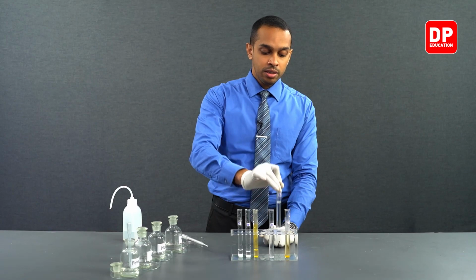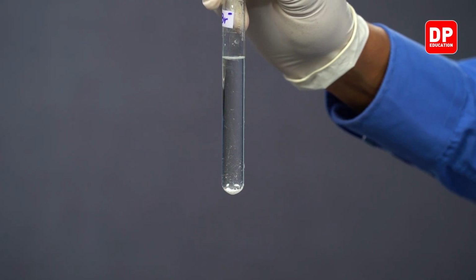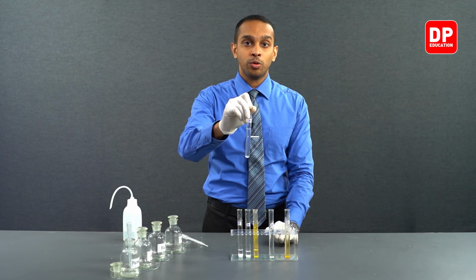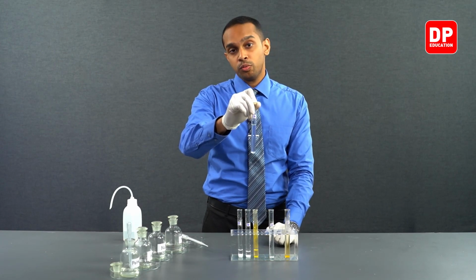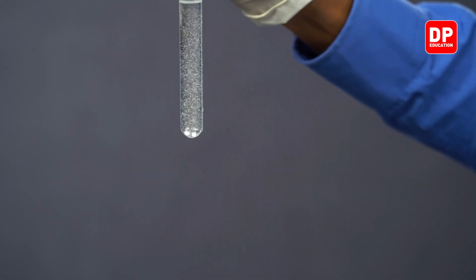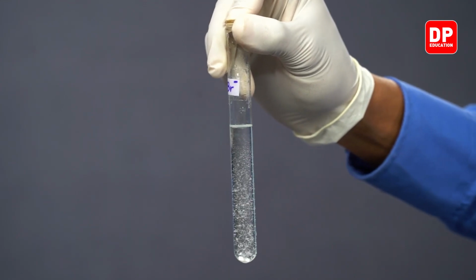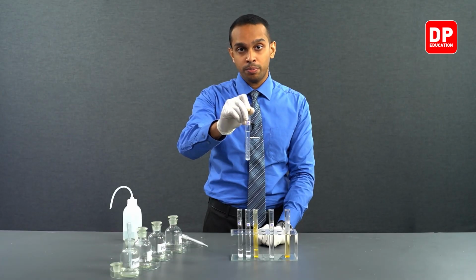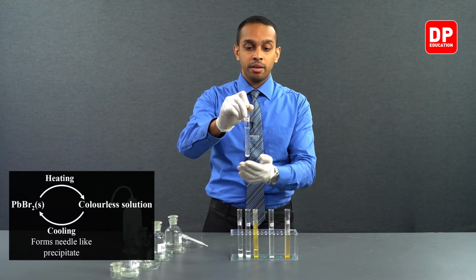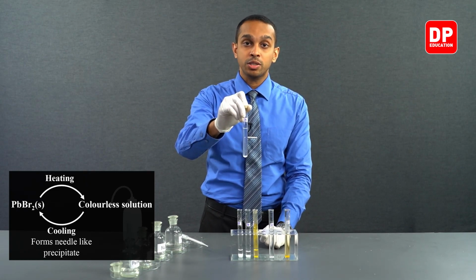And over here, we had a clear solution of lead bromide, which was formed by heating lead bromide solid in hot water. Now we have allowed it to cool down for a while. When I mix it up, you can see again a white color precipitate being formed, which is lead bromide solid, PbBr2 solid. So upon cooling, the hot lead bromide solution will form lead bromide solid.